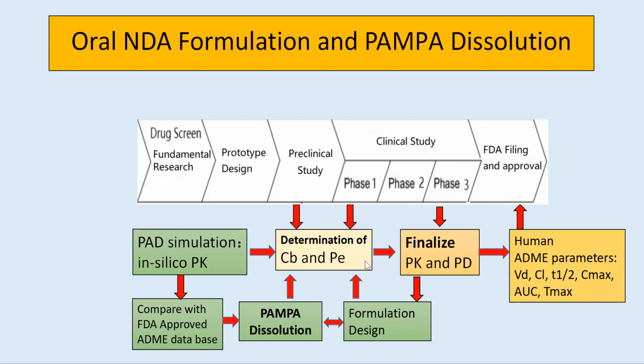It will help us figure out a fairly feasible way, with a shorter time and much lower risk, of predicting drug performance after clinical study, right? So we can predict that precisely using the PAMPA dissolution.